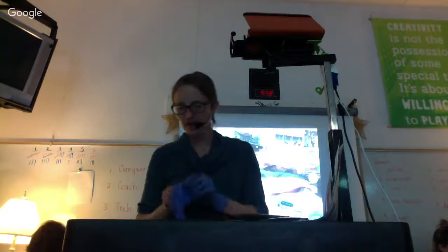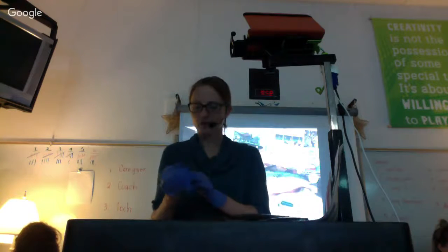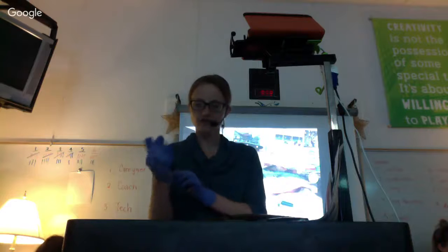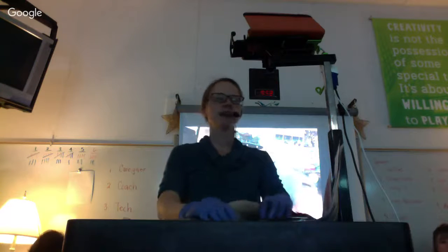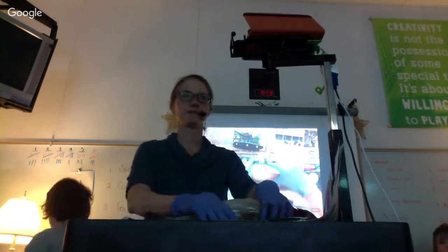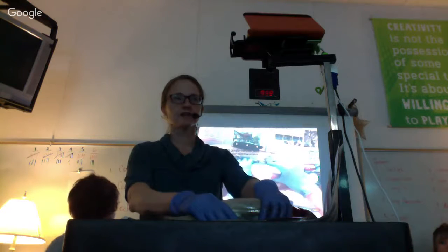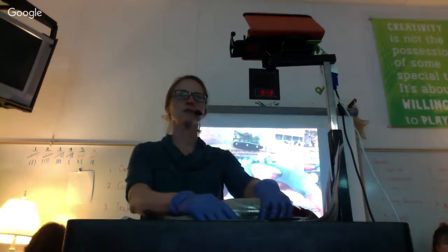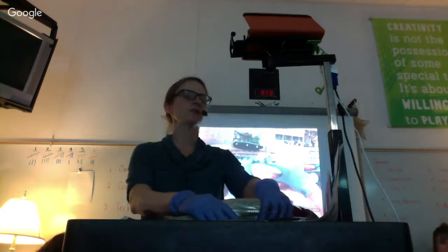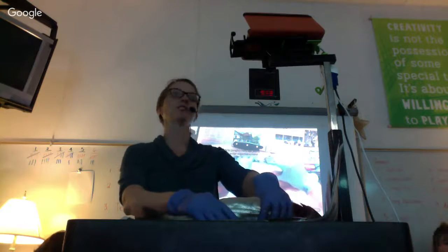Okay. So, we are now going in. 3, 2, 1, and 0. We are now going into the vent to find out a little bit about whether they will eventually be a boy or girl. So, this is the point. I'm going to wait till everyone's quiet. Still waiting. Now, just before we go, I would like you to turn to a neighbor and predict. Do you have a boy or do you have a girl?